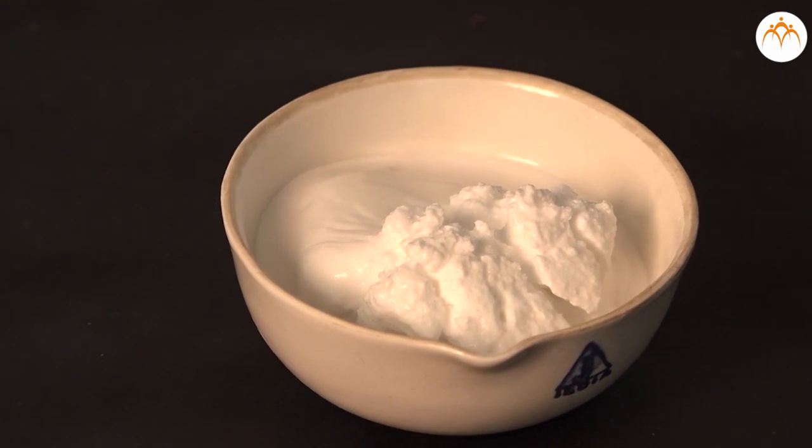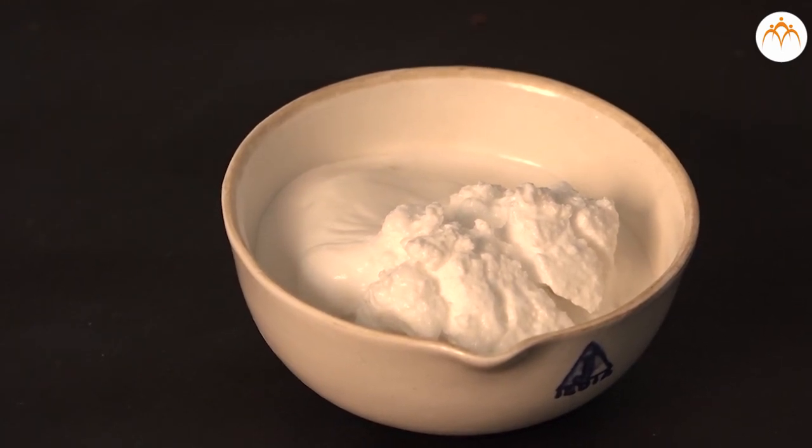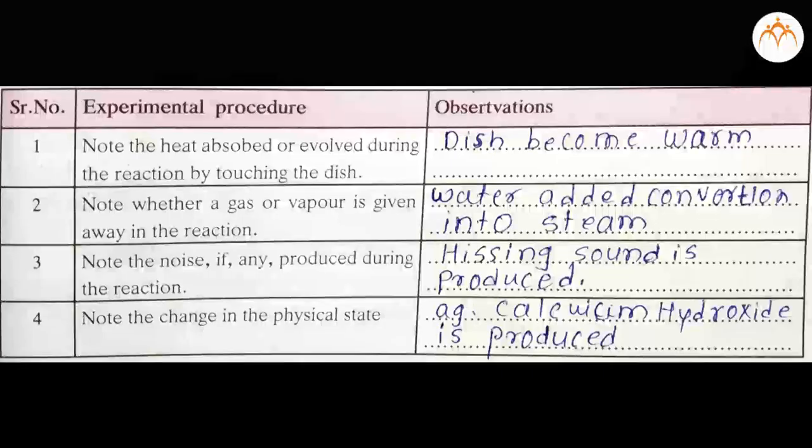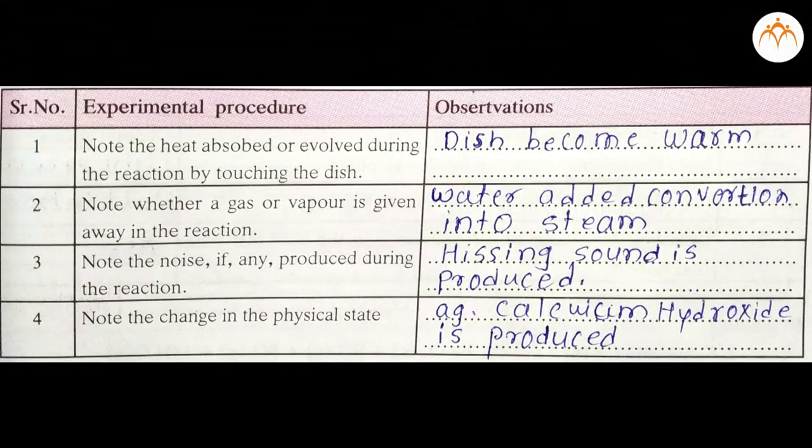A hissing sound is produced during the reaction. The china dish becomes hot, so heat is evolved. It is an exothermic reaction. Slaked lime or calcium hydroxide is produced. This is an example of combination reaction.